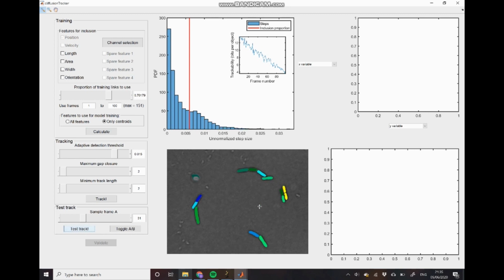And now that that's finished, you can see that we actually have a bit of a conflict going on here. So not only do we still have this issue down here where our threshold seems to be too lax, we also have this case up here where two cells which were being accurately tracked previously with the more lax threshold have now not been linked together.